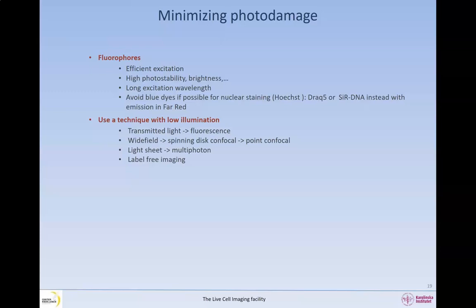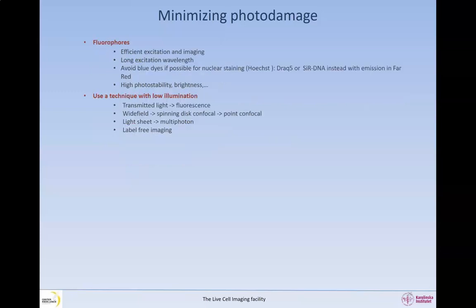Also, to avoid illuminating a double cone in Z, multiphoton illumination is a good option. Additionally, the long wavelength penetrates deeper in the tissue. Another option is to perform label-free imaging. How else can we minimize light toxicity? Your imaging medium can also induce phototoxicity and thus influence the well-being of your cells and the experimental results. Use cell culture medium with low flavins, vitamin B12, or phenol red.